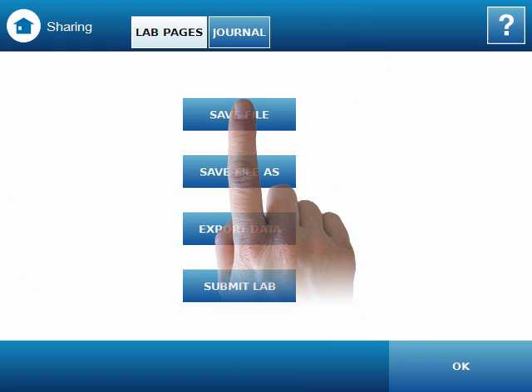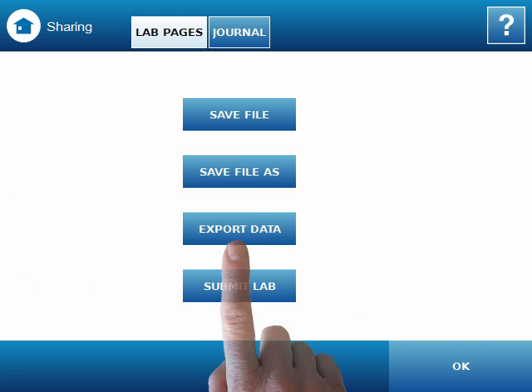In this screen, selecting save file or save file as will save the current lab as a Spark file on either the Spark Science Learning System or an external USB flash drive. The save file will include the entire lab, any data that has been recorded, and any journal pages that have been collected.